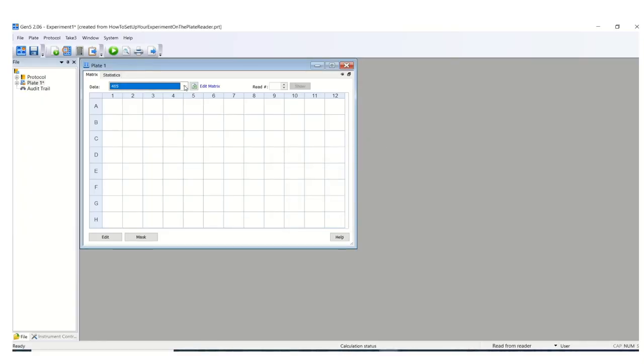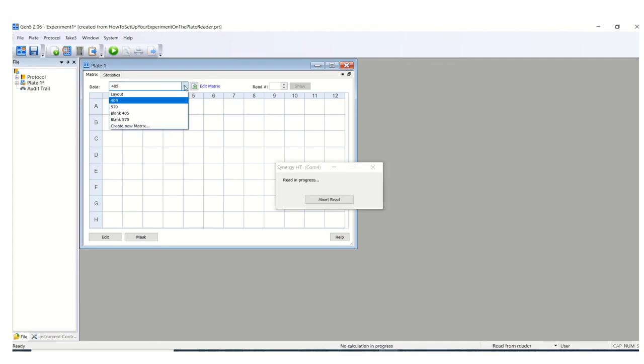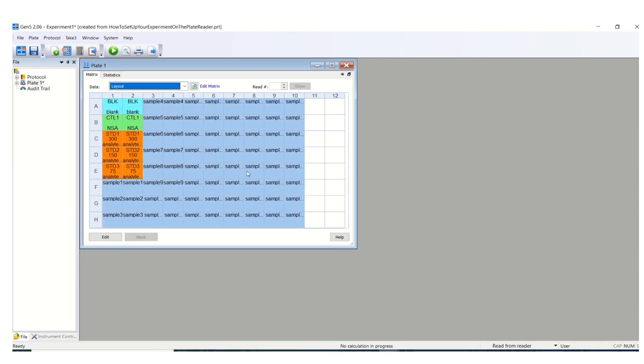After the read, you'll be able to toggle between the different wavelengths. If you had a blank wavelength, for instance, you can look at the blank-corrected read versus the raw reads prior to the blank correction. Finally, you can export an editable Excel format of the results by clicking this icon, and then you can go ahead and analyze your data.